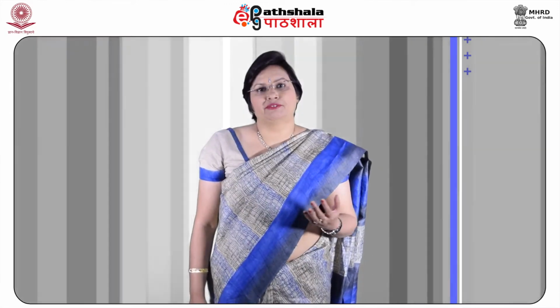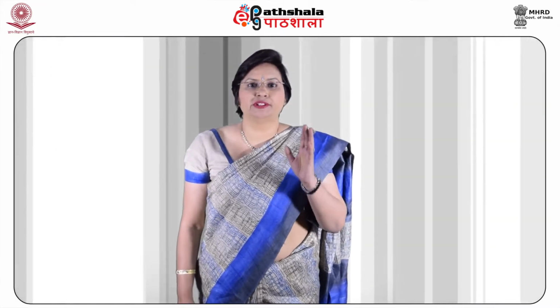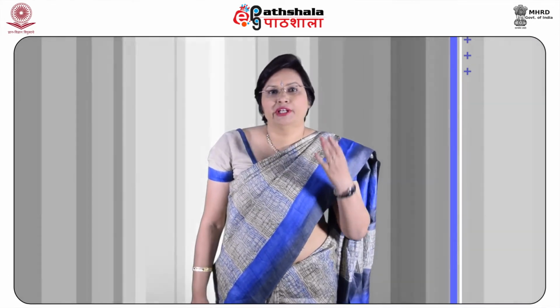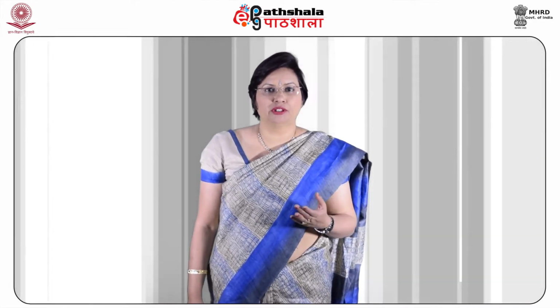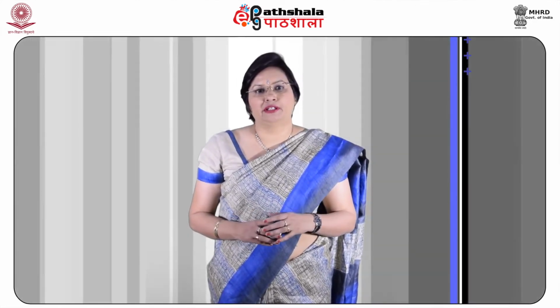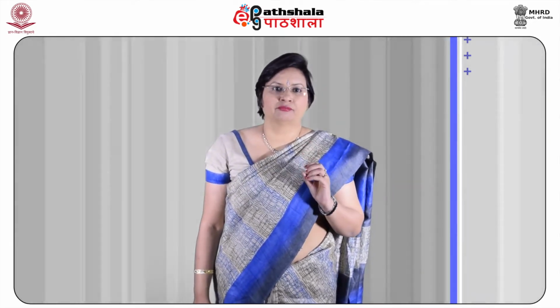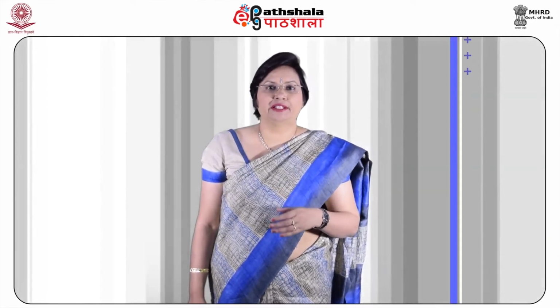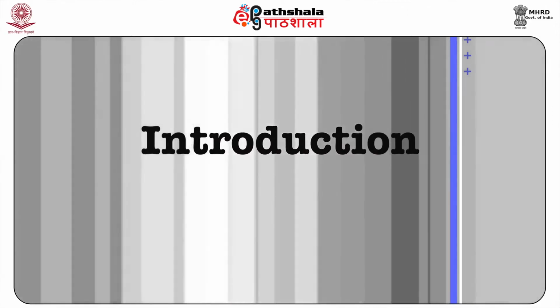Dear students, after studying this module, you shall be able to know about the methods for the determination of water quality parameters. You should be able to learn various analytical techniques for determination of different species in water and evaluate the total hardness and alkalinity of water. And you shall be able to analyze the different metal ions which are present in water. So, let us begin with the introduction.